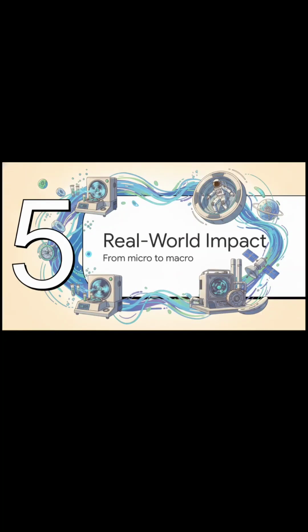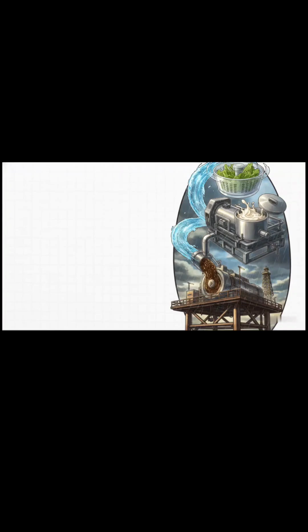Finally, Section 5. Real-world impact, from micro to macro. Let's zoom out a bit. You probably actually use a basic centrifuge right in your own kitchen. A simple salad spinner removes water from washed lettuce using, you guessed it, centrifugal force.